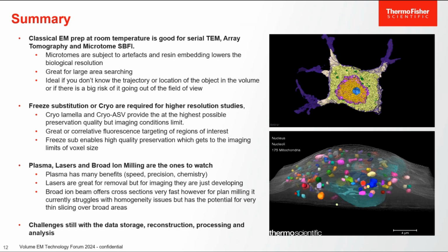There's not been a lot of innovation in detectors. That's something that we're working on. I think with the demands for speed, we rely a lot on the stains, and now people are going to minimal stains or no stains. We can get good contrast even from resin samples these days with no stain. It does put a lot of challenges on the detection. So actually, this is something that we're working on. I think at the moment, though, we have detectors which work at the speed at which the resin permits. But moving forward, that's definitely something that we want to improve.